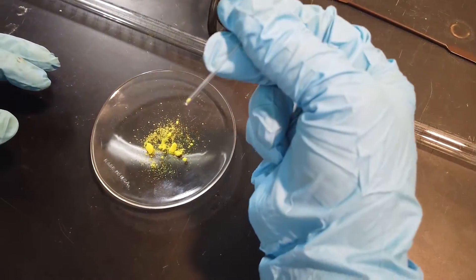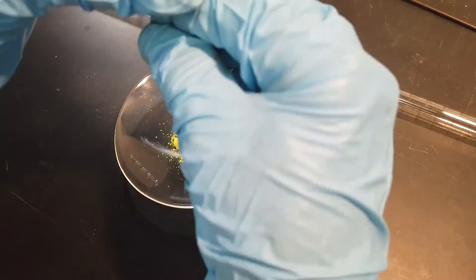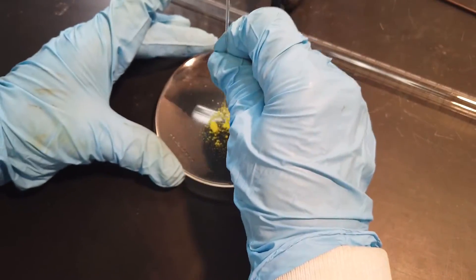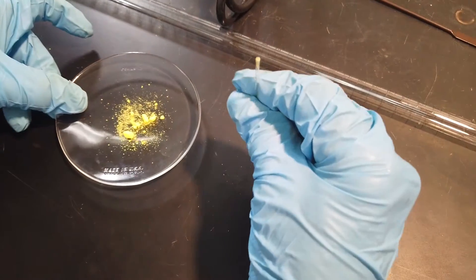Then turn it over and gently tap the capillary tube on the lab bench to get the solid to fall to the bottom. Repeat this step until you have a few millimeters of solid at the bottom of the tube.